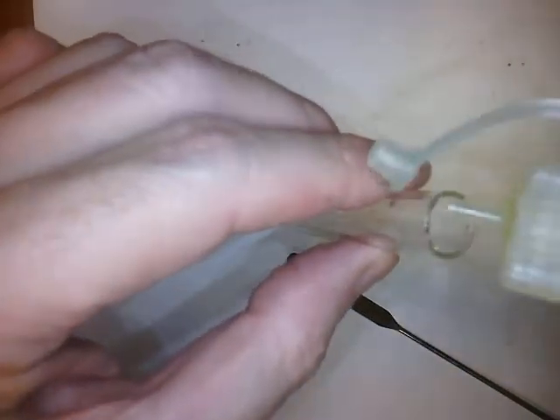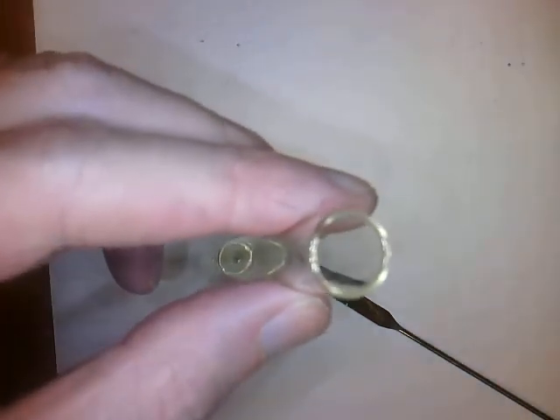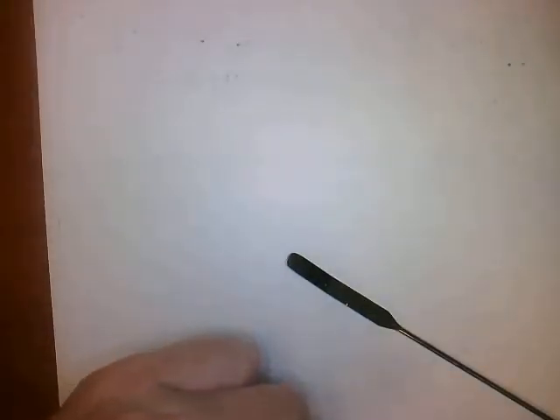So we will add ferrocyanide to this. And initially it dissolves. And then it starts producing a precipitate. You look at the test tube, you definitely got a brownish-red colored precipitate that's not dissolving, no matter how much you shake it.